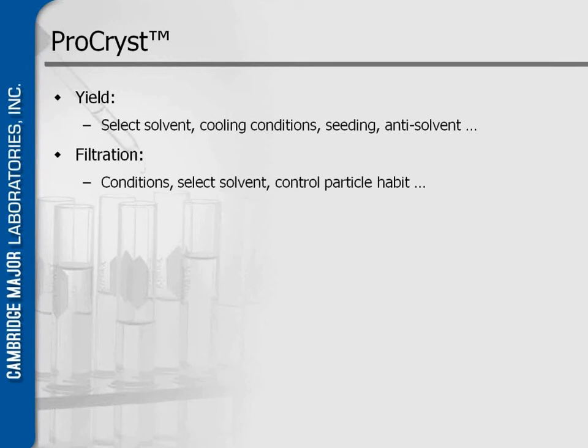Filtration, of course, each process has some of these bottlenecks where you have poor filtration, where you have a very needle-shaped morphology of your crystals, and these block your filters completely. So you have to wait for days before something is really filtrated or before everything is dry.